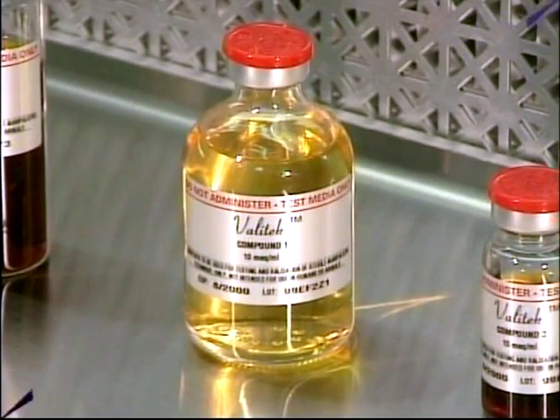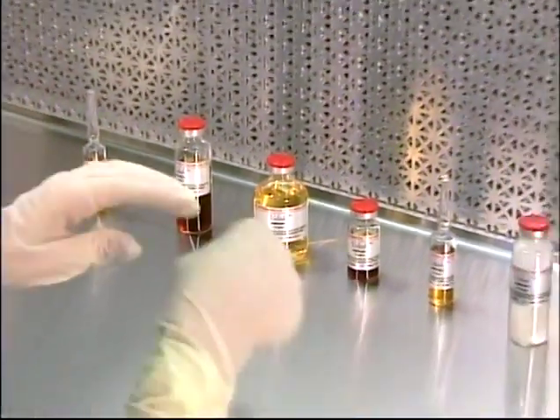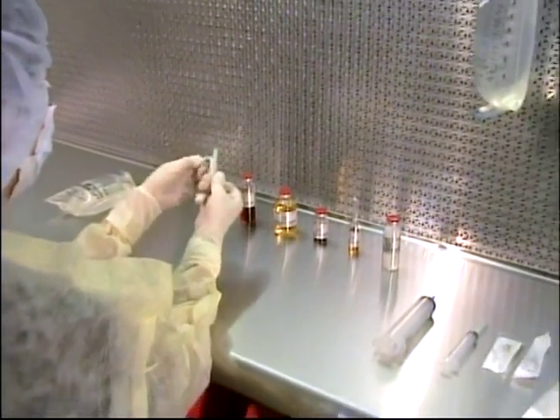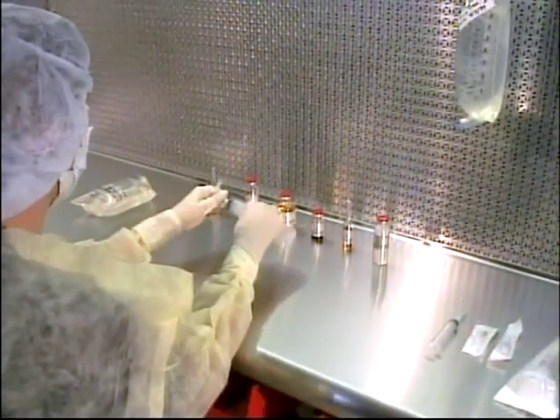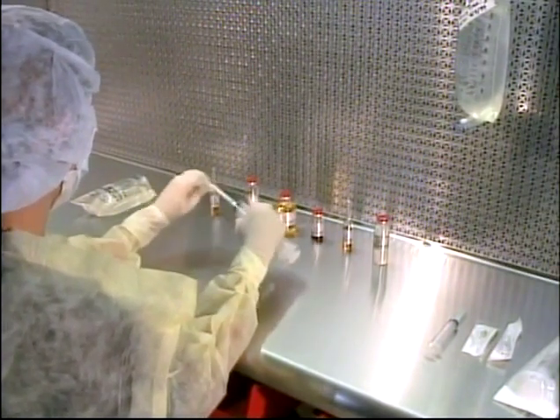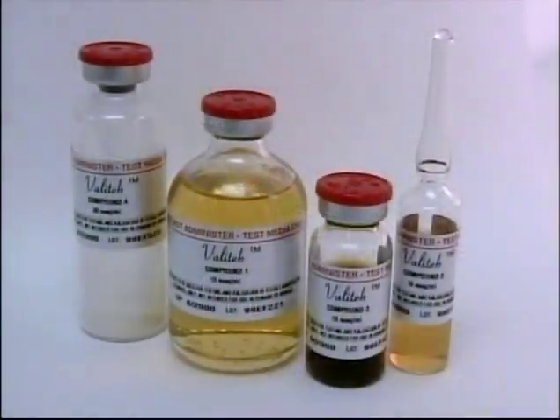As an IV admixtures specialist, you will be asked to perform a validation exercise which demonstrates your ability to properly use your institution's engineering controls, personal barrier controls, and aseptic manipulations to accurately compound contamination-free product. During this validation, you will be asked to use sterile microbiologic growth media to simulate the proper compounding process.